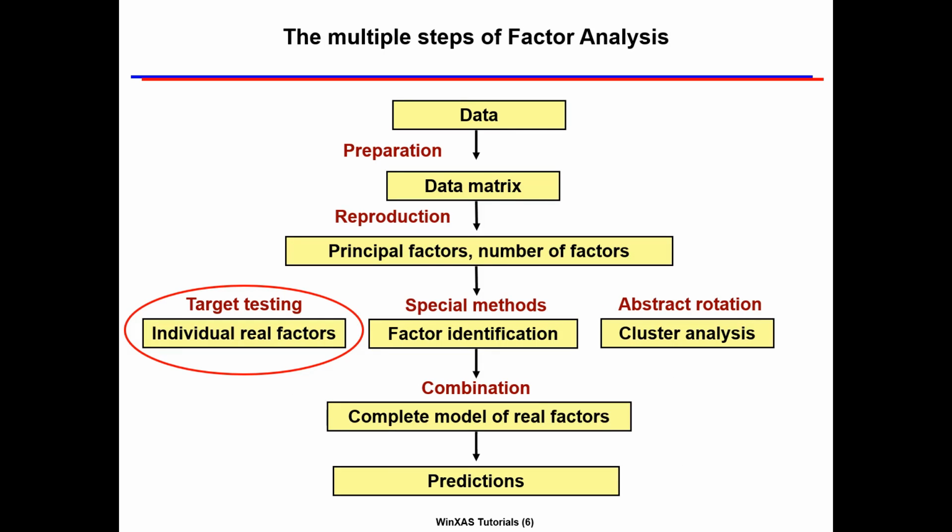Factor analysis is a multi-step procedure that starts with the series of suitable, which means carefully pre-treated, experimental XANES spectra. Next comes a technique known from linear algebra as singular value decomposition, which among other results yields the number of primary factors, which correspond to the number of phases in our samples.